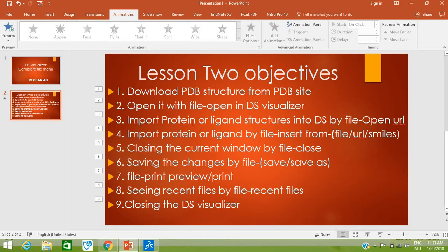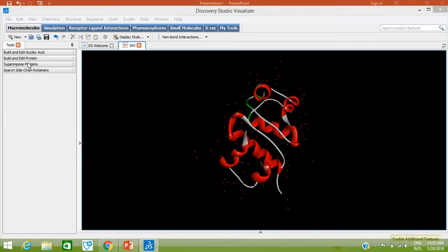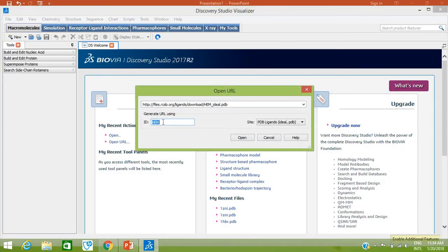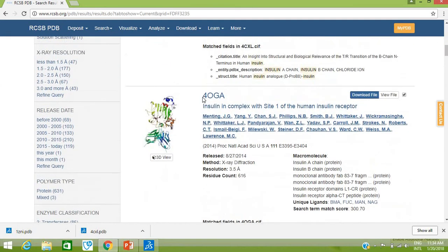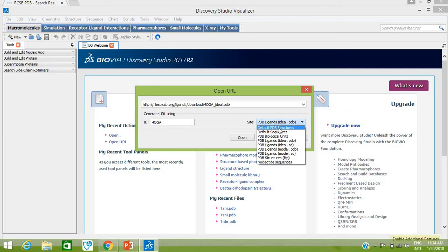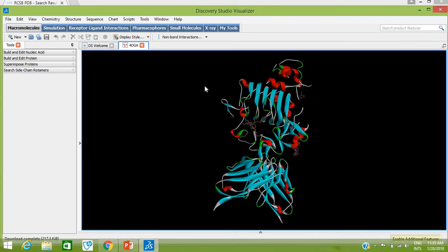Our third objective is to import a protein or ligand structure into DS Visualizer by File > Open URL — directly from a URL. Close the currently opened window by going to File > Close. Now go to File > Open URL; this window will be opened. Here type the name of the protein, for example 4OGA. You don't need to change the URL format, but make sure to select PDB Structures (not PDB Ligand). Type 4OGA and click Open. Your structure has been directly imported from the PDB database into Discovery Studio Visualizer.